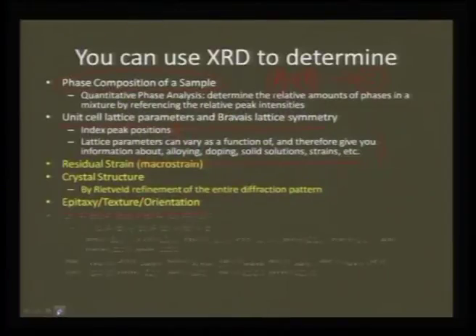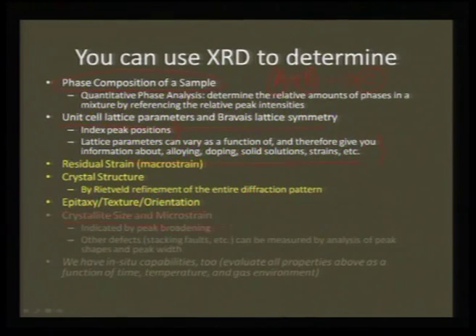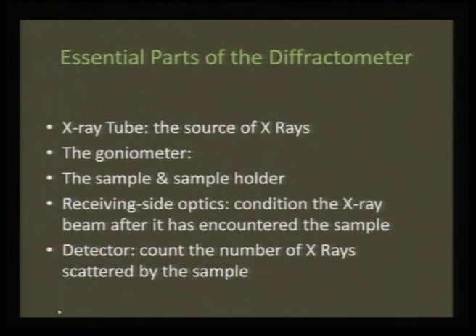As I had shown you in the previous modules, a chemical approach to thin film is quite different from a physical route to make thin films, and we are talking about a very high degree of epitaxy or ordered growth. In such a case, how can we use X-ray for mapping that, and also other information like peak broadening that can tell us about crystallite size, microstrain and so on. So, we will try to revisit some of these aspects as we go through this lecture, and I am going to show at least one example of each of these that we are trying to discuss in this talk.